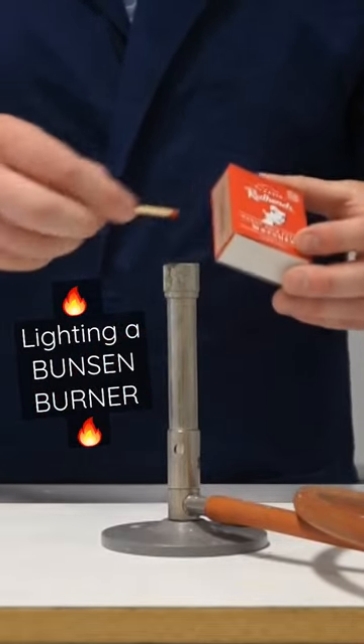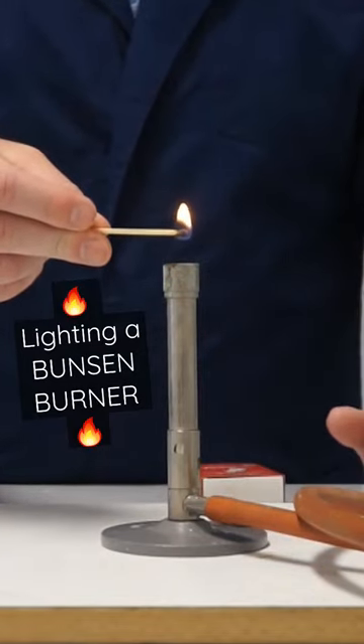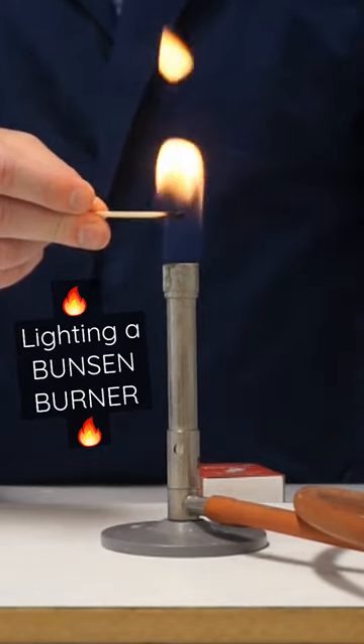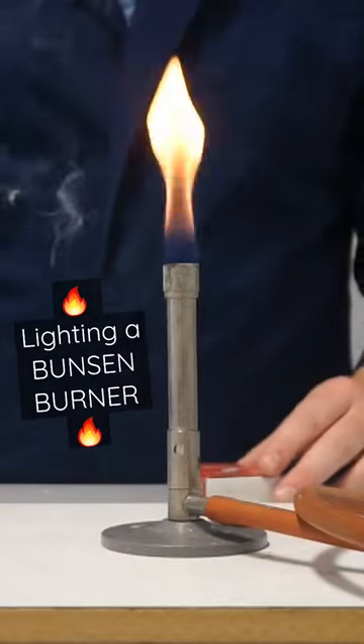So I'll light my match, hold it about one centimeter above our barrel, and slowly turn the gas on. And once I can see that it's lit, I can take the match away and extinguish it.